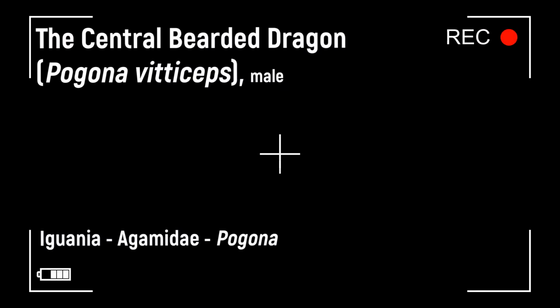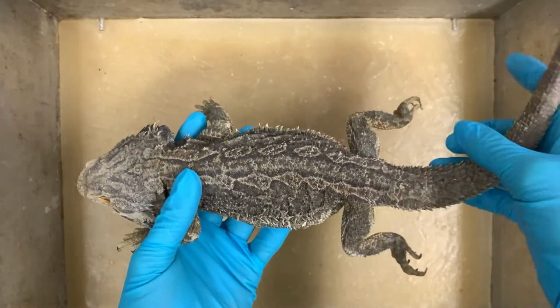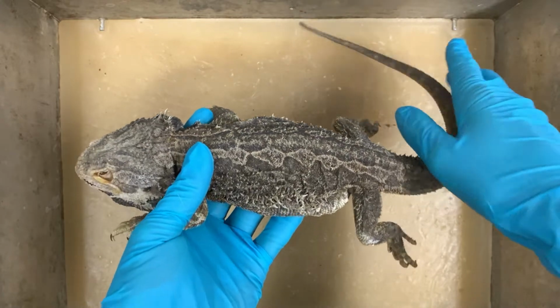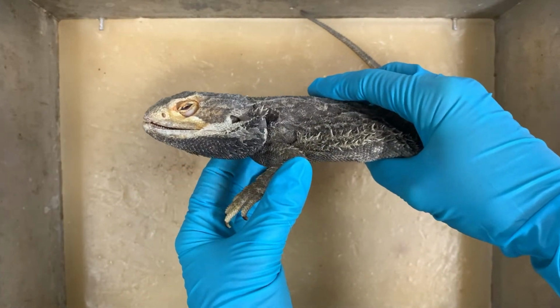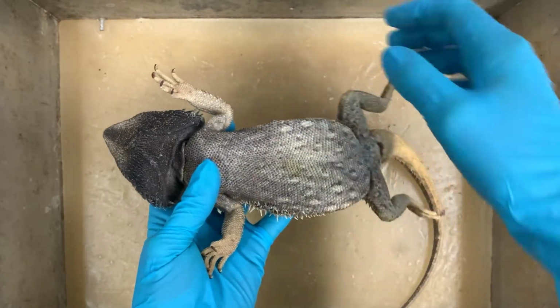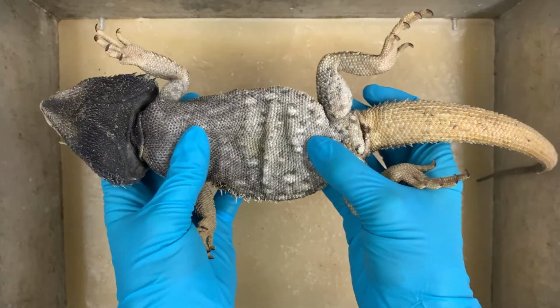Our next object is the bearded dragon, Pogona viticeps. This is a representative of the family Agamidae, the agamid lizards. Bearded dragons are from Australia, but are very popular in the pet trade. They are omnivorous lizards adapted to arid landscapes. The scales of Pogona viticeps are imbricated, that is, they overlap one another, and they are keeled, so they have a central ridge. Scale shape in squamates can be important for taxonomic purposes.